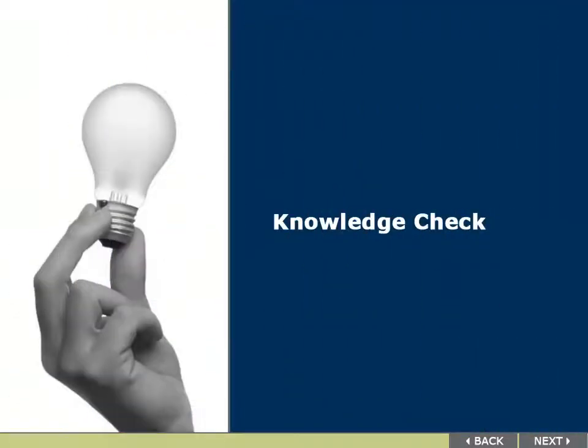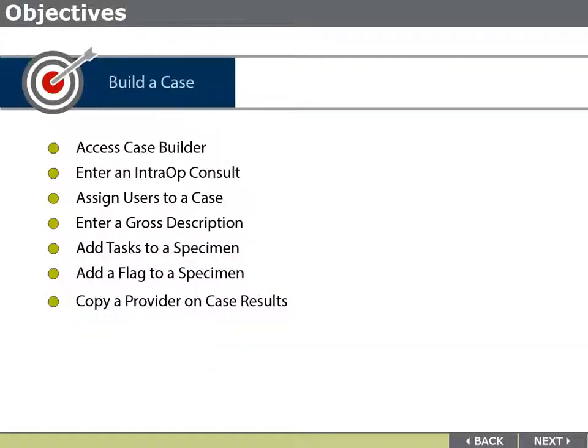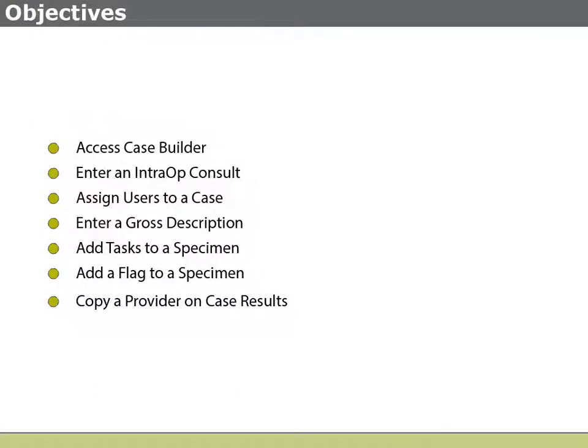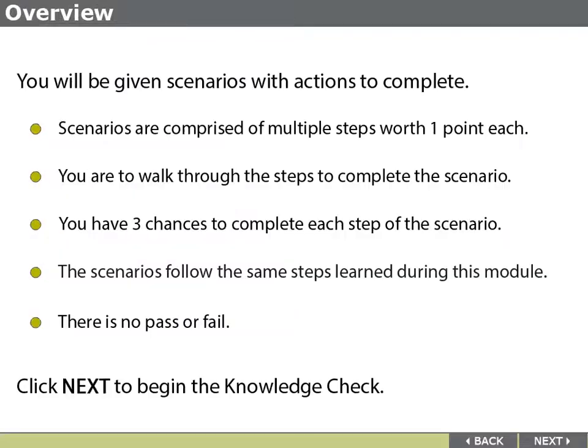Knowledge Check. In this Knowledge Check, you will access Case Builder, enter an intra-op consult, assign users to a case, enter a gross description, add tasks to a specimen, add a flag to a specimen, and copy a provider on case results.